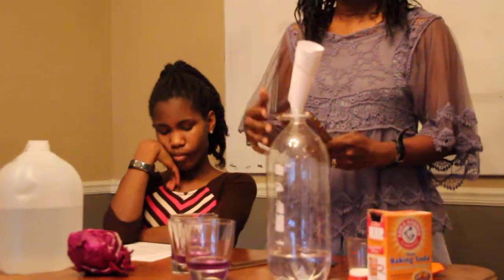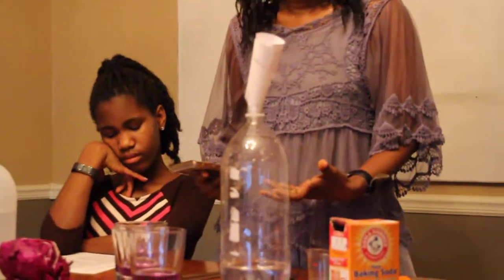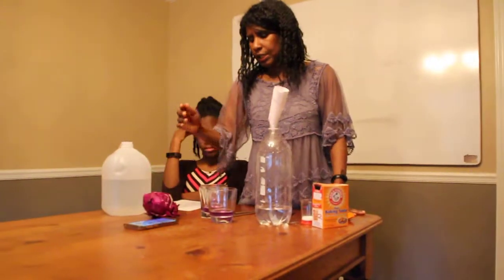All right, so I want you to think about that. What is being produced from the combustion in my body, right? I'm getting energy from the meals that I've eaten, but something else is produced. All right, let's go to the second part of the experiment.